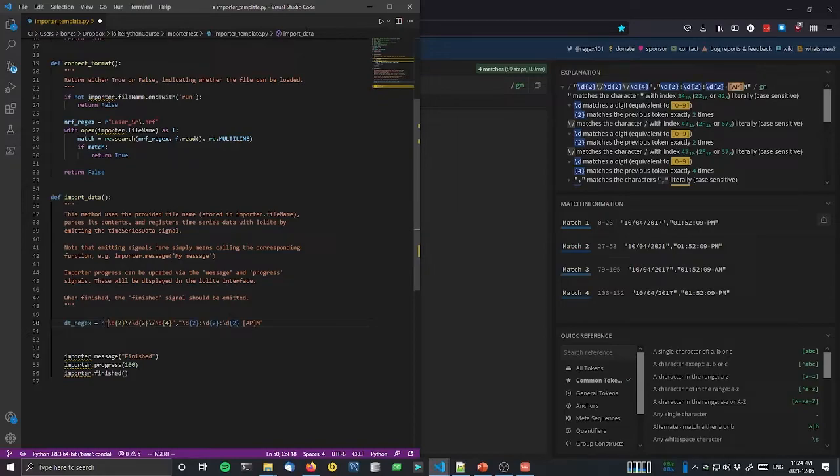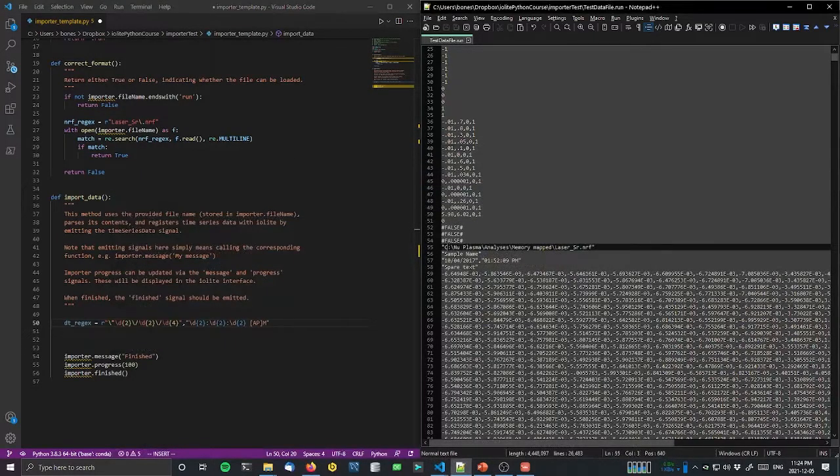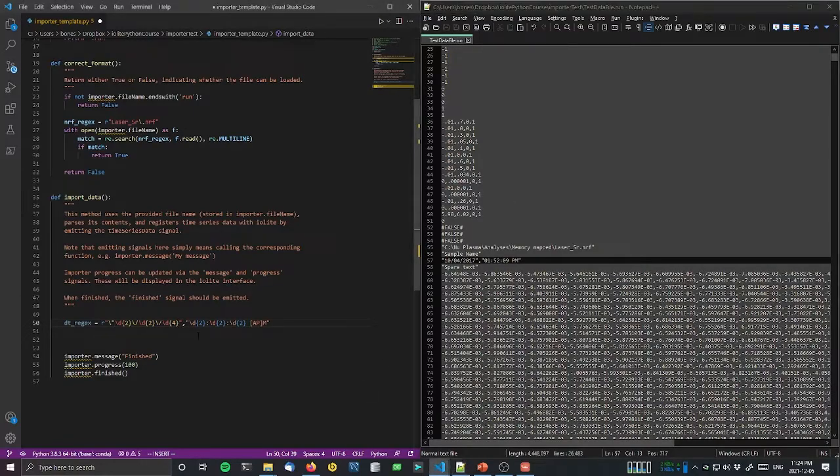those quote marks are going to confuse it and think that we're actually ending our quote. So we'll enclose that and we'll escape them. So I'm escaping this first one because remember, in our file we actually have quote marks in this line, and we need to tell it that this is actually a character we're looking for, not the end of our string here. So if I escape that one, and there's another one to escape at the end, and then I actually want to close my quotes. Okay, so that's our regular expression sorted.